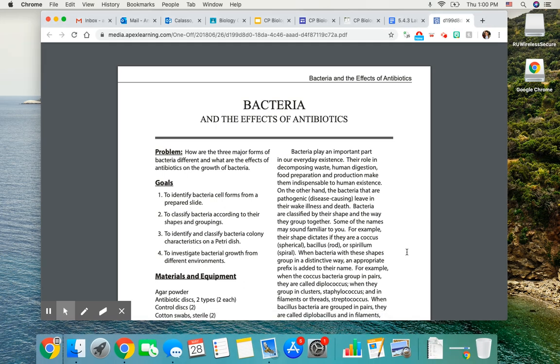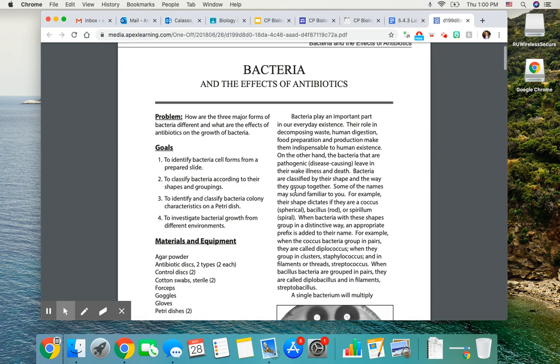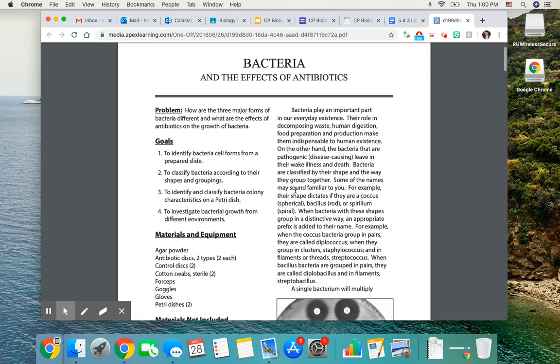So I'm making this video to go over the 5.4.3 lab on antibiotics. I'm going to briefly go over what the lab is actually having you do, and then I'm going to go through every single question that you need to complete in the pre-lab and the post-lab.